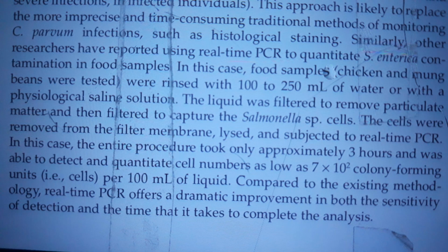Similarly, other researchers have reported using real-time PCR to quantitate S. enterica contamination in food samples. In this case, food samples like chicken and mung beans were tested, and were rinsed with 100 to 250 ml of water or with a physiological saline solution.